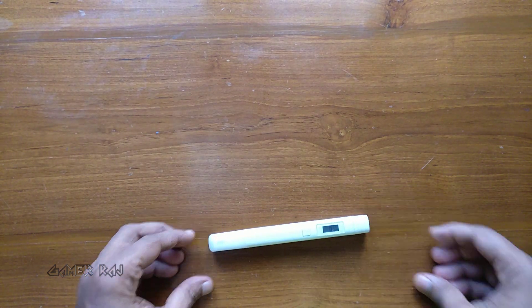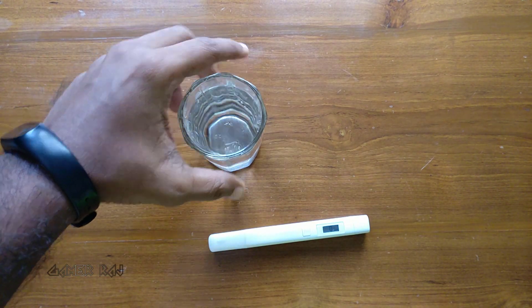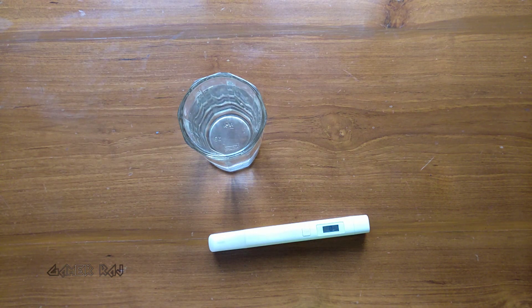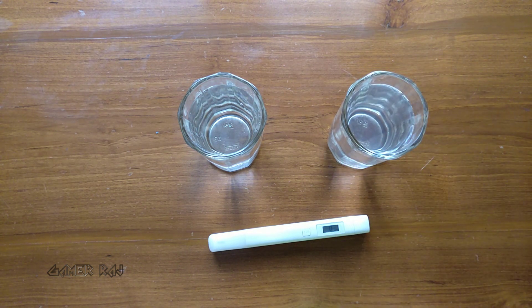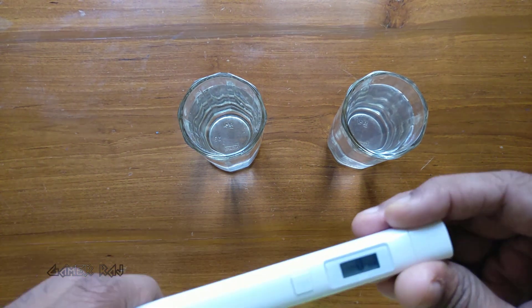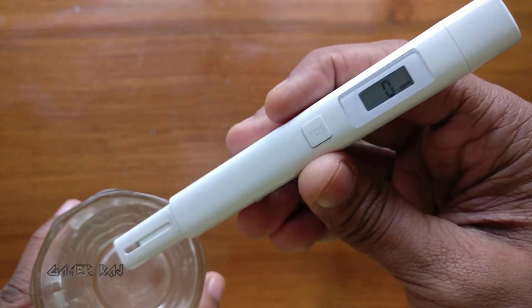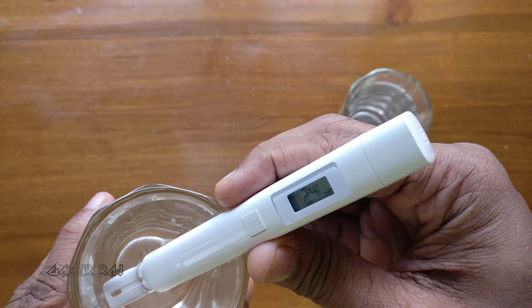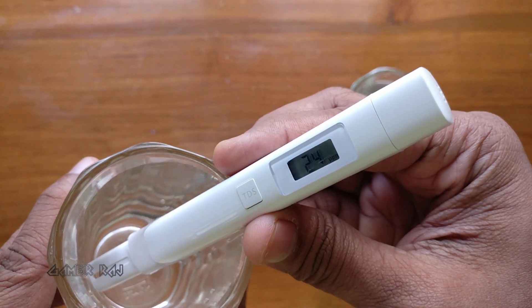I am going to test 2 water samples. The first glass is a fresh tap water sample. The second one is a week-old tap water sample which was left uncovered.